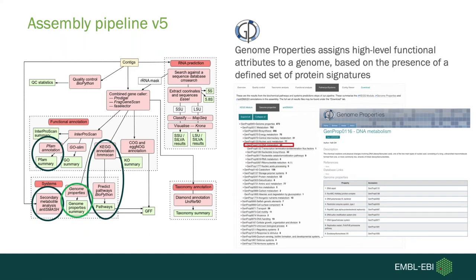Next we look at genome properties. We've taken InterProScan annotations and used them to look at what pathways we can identify. Genome properties assigns a high-level functional attribute to genomes based on the presence of a defined set of protein signatures. The properties — which often describe pathways — are composed of steps, each defining a protein required for that pathway's function. Users can browse the genome properties arranged within a hierarchy and link out to the genome properties website.